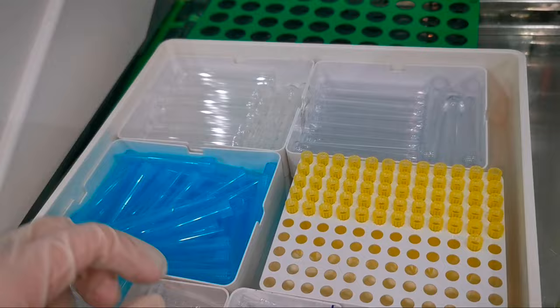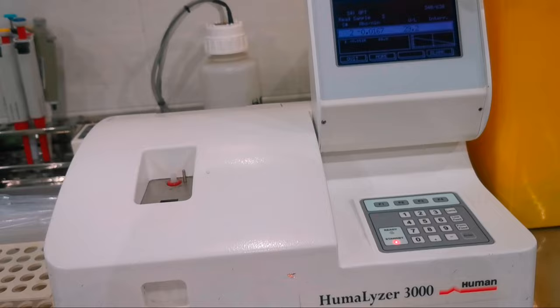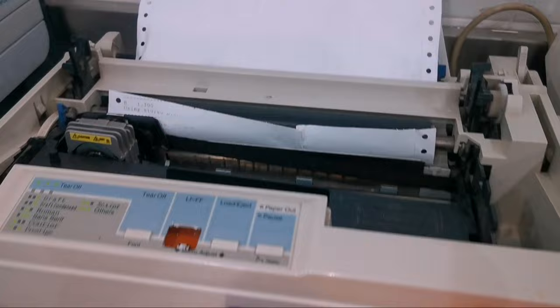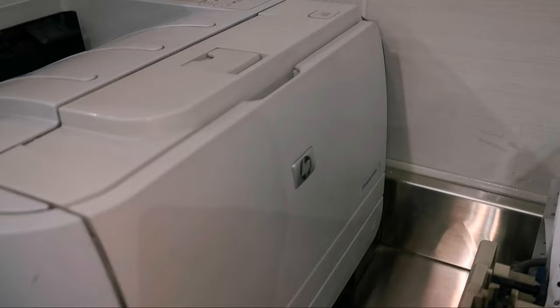This is the sample cup, microtube, pipette tips, glass tubes and plastic tubes, disposable pipette. Spectrophotometer. Reflotron plus printer and the control sheet.